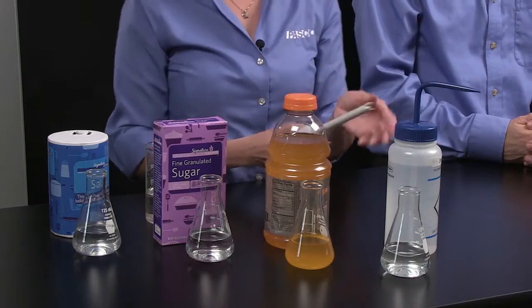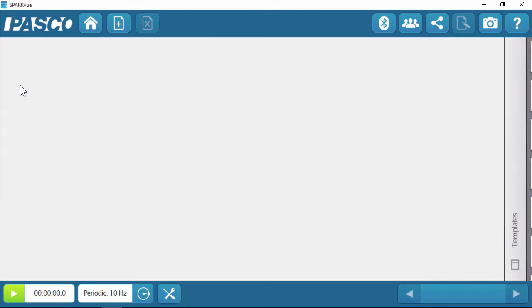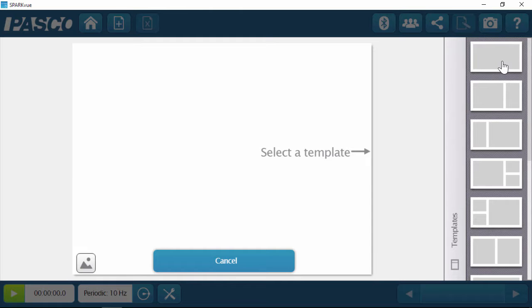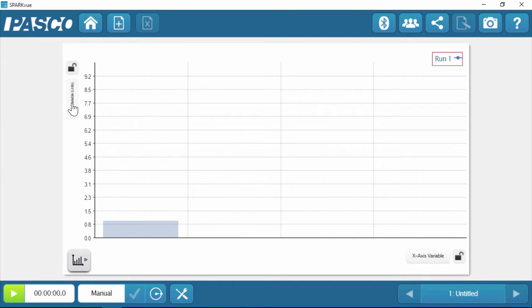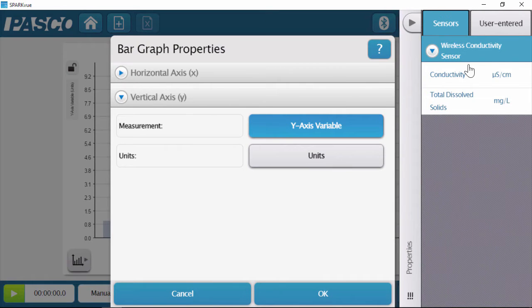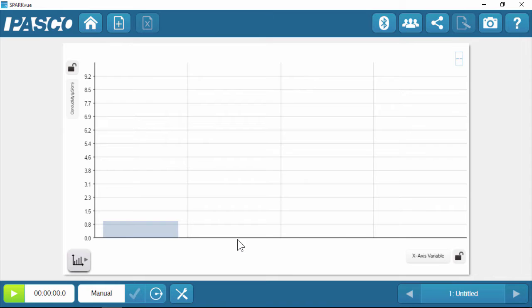The sensor is also water resistant, so it's easy to use with an experiment like this, where we're going to be testing the conductivity of several different solutions. Since we're going to test several different solutions, we're going to set up the software to measure in a bar graph so we can categorize each of those solutions. I'm going to go into Spark View, touch on build, select the big template, and touch on bar graph.